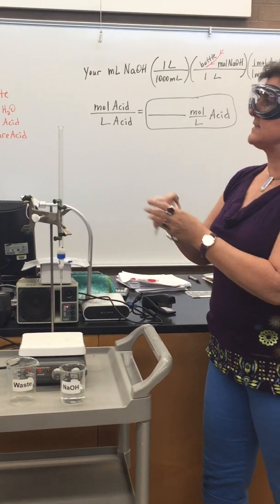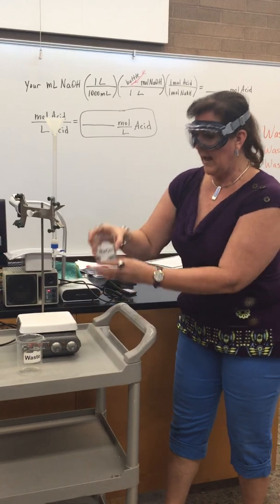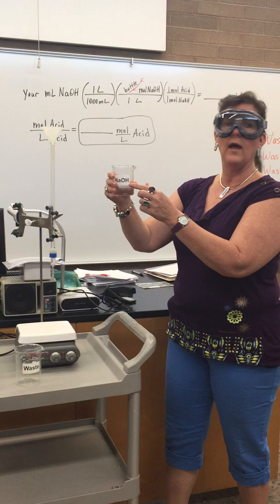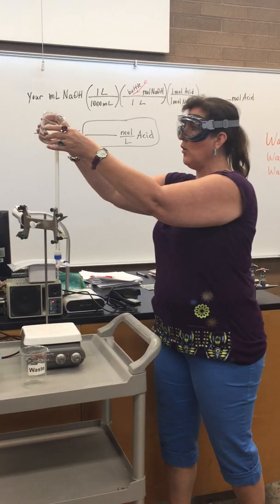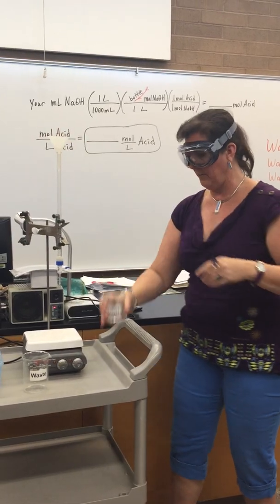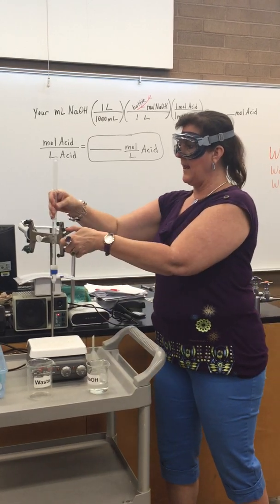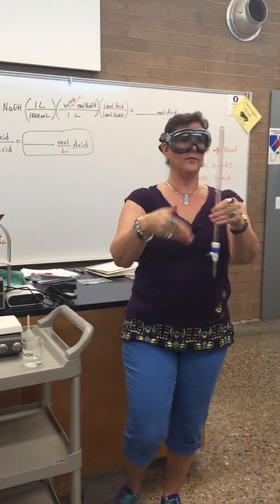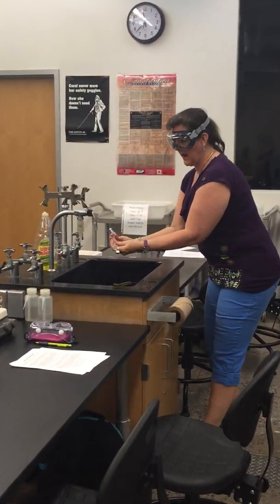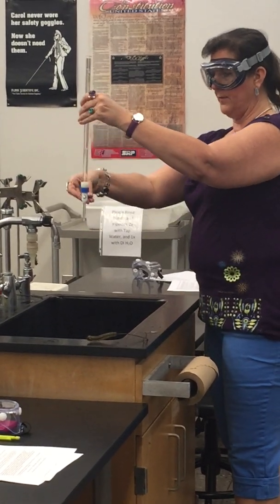Now we need to rinse the inside with sodium hydroxide. Grab the funnel, put it on top, and add some sodium hydroxide — be careful with this, it's a strong base that has already been collected. Pour a little bit in, not too much; you don't need to fill it all the way up. Take the funnel off, then go to the sink to rinse: pull it sideways, roll it around, and let it come out through the tip.